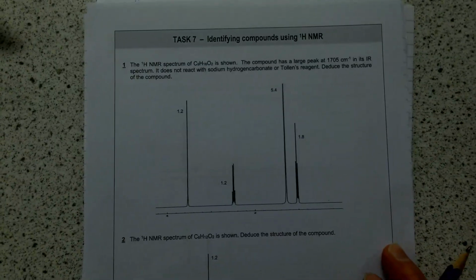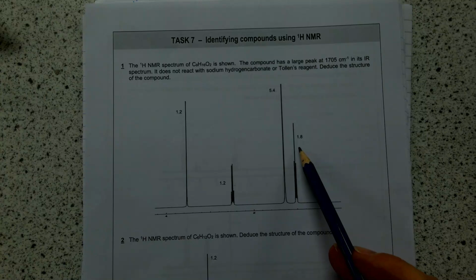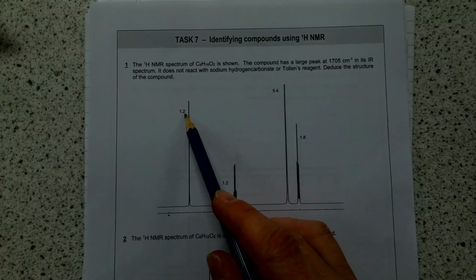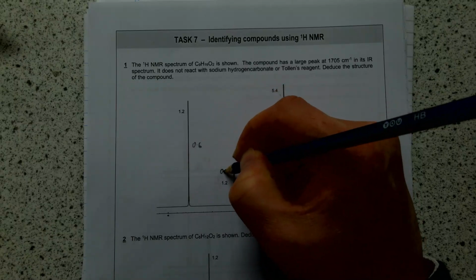Sometimes the area under the peak is given as a set of numbers, 1.2 to 1.2 to 5.4 to 1.8. This is quite a relatively complicated example. Might want to have all eyes here. I know we've been through this, but if I just show you this one here, sometimes the area under the peak is given as numbers like that. And that ratio, hopefully you can see, we might have to simplify it, well, make it down to 0.6 to 0.6.